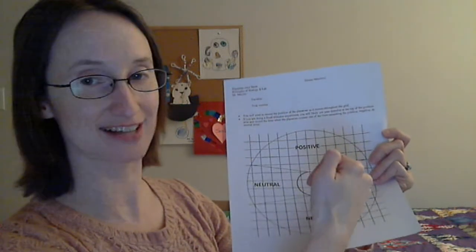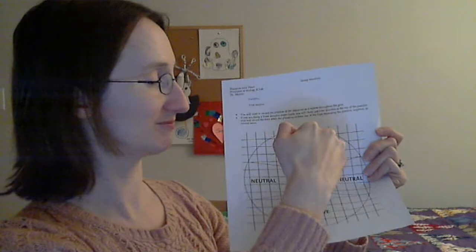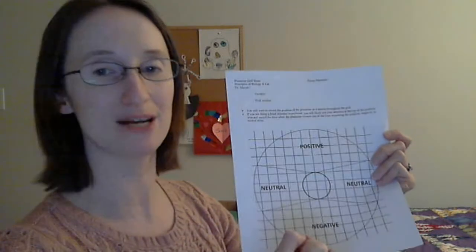And maybe what you find is initially the worm went up there. So at time 5 seconds it went up there, and then at time 15 seconds it crossed this other line. So again, you're going to be drawing the path and noting those times when it crosses between positive and neutral. And then maybe it went right down to the bottom and then stayed in this area for the next over 4 minutes. So 5 minutes, 5 times 60, that would be 300 seconds altogether.